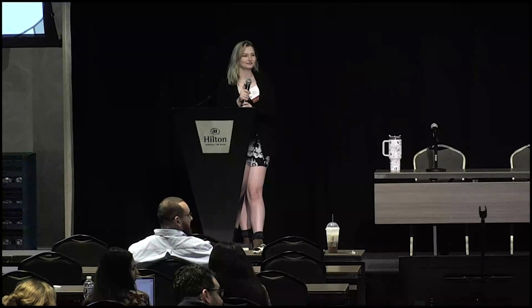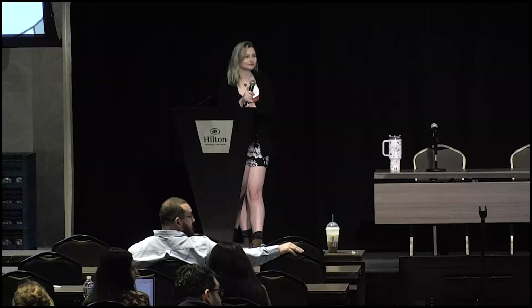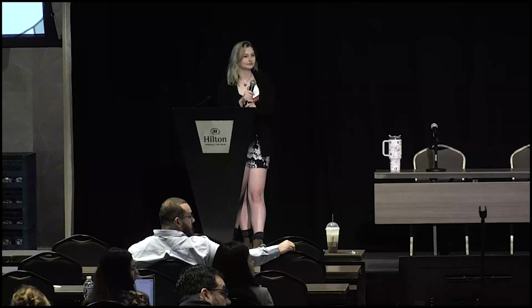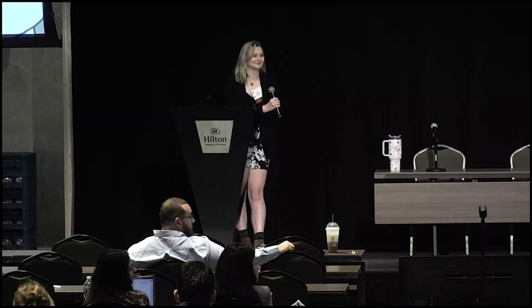Hi, thank you very much for the presentation. It was great. I really appreciated the approach to it. The first was just a comment to add in, and the second was a question. We had also noticed that there's a GreenGate version 2 now that had incorporated some of the items you had said it was missing. It was also our understanding that it was still compatible with the multi-green and the old GreenGate kit, if you had any comments on that. And then, you had mentioned the size of the plasmid that you're working with yourself. I was just wondering what levels of efficiency you were getting in terms of using it downstream.